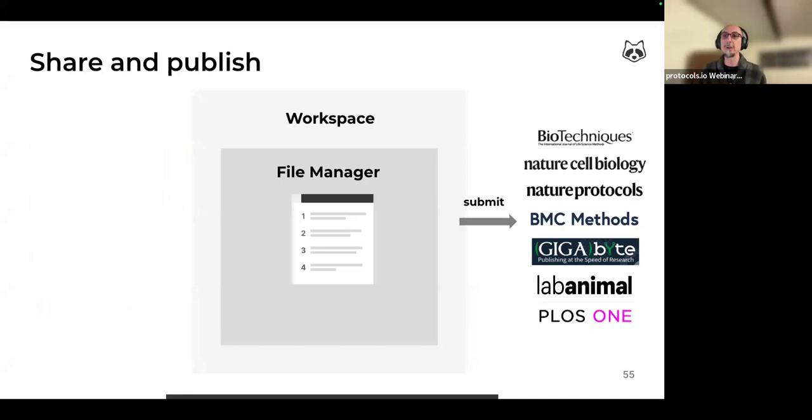Another way to share your protocols and to increase your credit for method development work is to send the protocols for peer review as standalone methodological papers to Biotechniques, Nature Cell Biology, Nature Protocols, BMC Methods, Gigabyte, Lab Animal, or PLOS ONE.